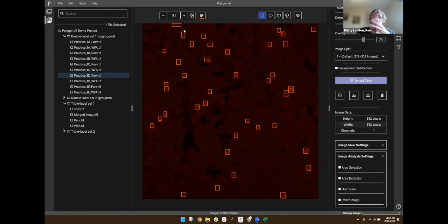And if you have several of those in your example images, then the model will learn to count those. But if you don't want to count a half cell like that, just don't annotate them, and the model will learn to ignore those. I'm not sure if that was related to your images without seeing an example, but it reminded me of that. Exactly that. Thank you so much.